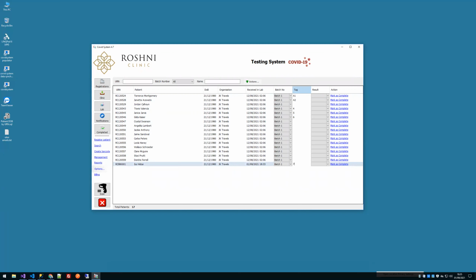So the sample is put into the well numbers, or 96 is the highest, isn't it? So yeah, these are assigned well numbers, and this is how you link the patient's sample test drop into the actual well number itself. Mm-hmm. So once you've got this stage, the technician's got all the information they need to go on batch.